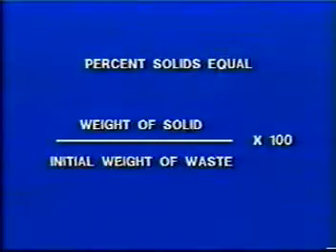The percent solids can then be easily computed with this formula. Percent solids equals weight of solid divided by initial weight of waste, multiplied by 100.